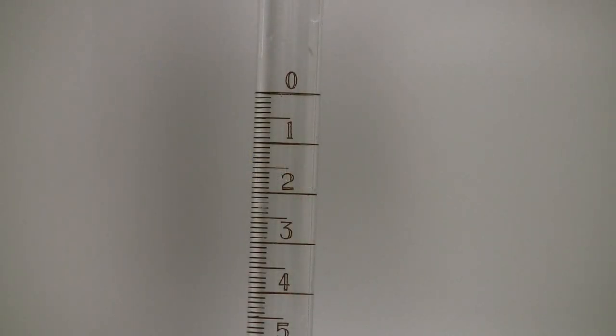Graduated pipettes are marked every .1 milliliter, which means that they can be used to measure liquid volumes to the hundredths place. Notice that the markings start at zero at the top and increase down the length of the pipette.